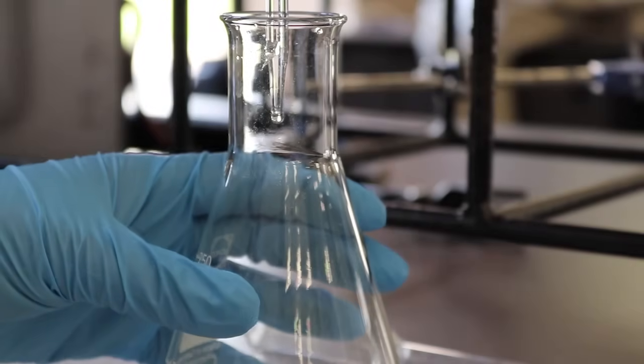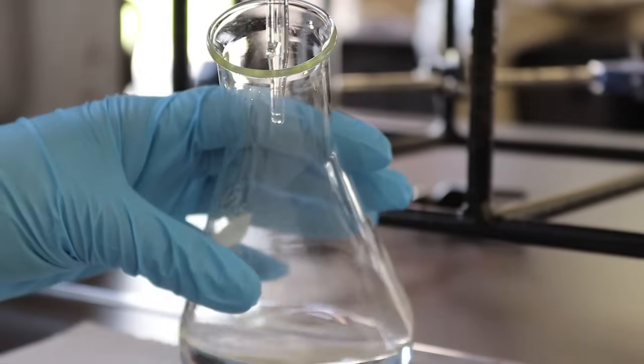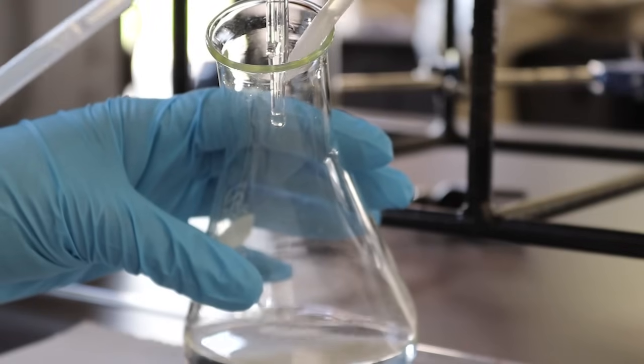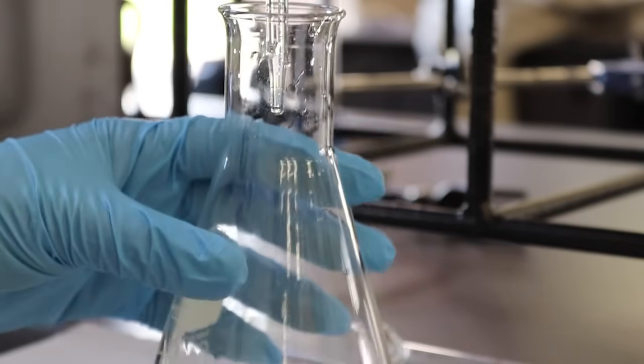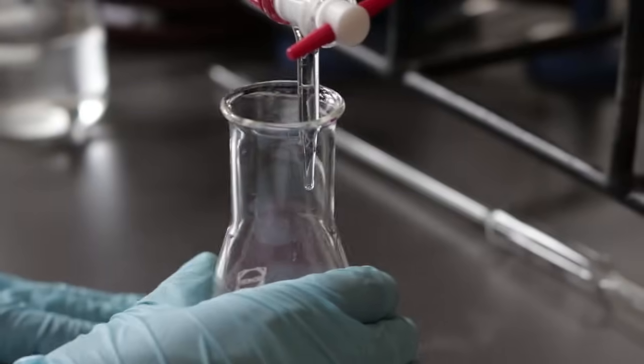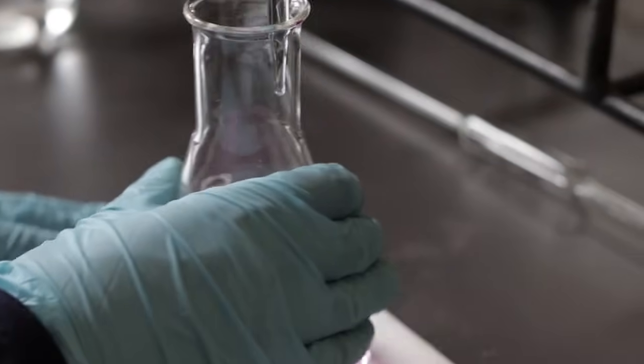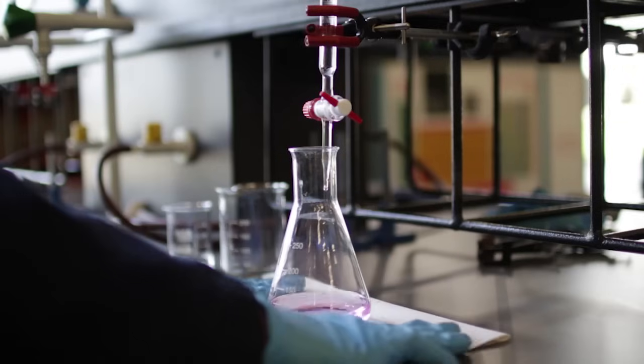If there is a droplet hanging on the tip of the burette, wash the droplet into the flask using a wash bottle, especially when approaching the endpoint. Washing off the titrant will result in a more accurate and precise result.